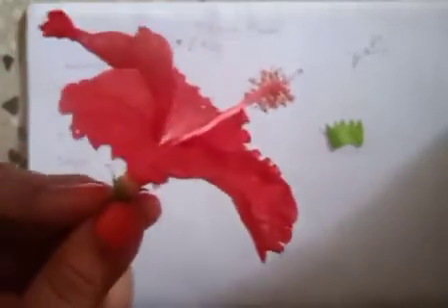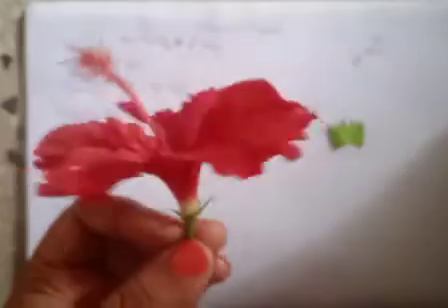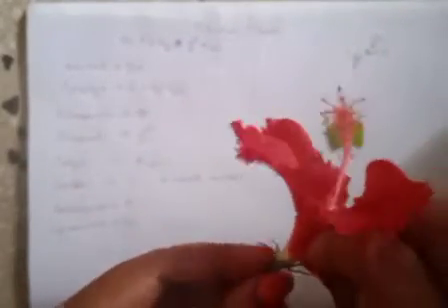So they are twisted. Okay, so I am trying to remove the corolla one by one. They are not fused, so I can remove it one by one. First I'll just loosen the corolla a bit so that I do not harm the androecium and the gynoecium.